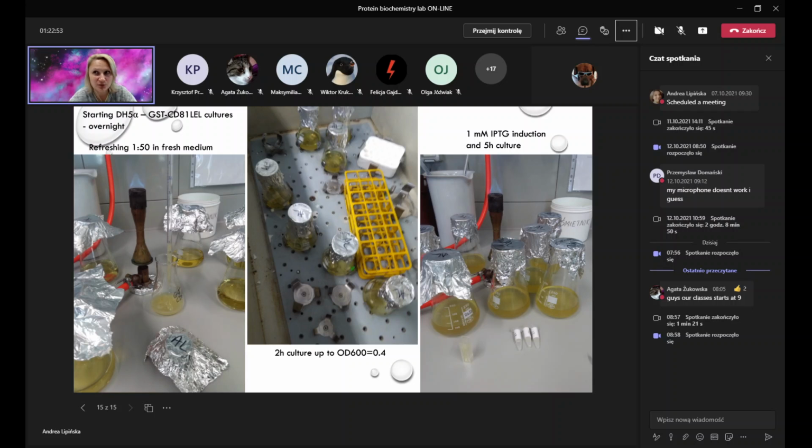I told you that our promoter is a bit leaky. So the best negative control for the Western blotting will be empty DH5 alpha bacteria. Sometimes we use the bacteria before induction, like time point 0, before addition of IPTG, but then you will notice some basal expression, for sure, always. Therefore, it's best to just use empty bacteria to compare if you want to see where your protein of interest is. You will know it from the protein size, but if you get many bands and you want to check which are specific and which are not, then you have to have proper controls.